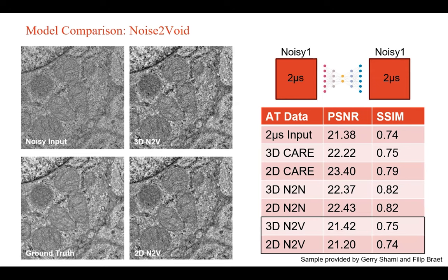Finally, I tried Noise2Void in both 3D and 2D, and unfortunately it didn't work. The output is still noisy for both the 3D and 2D models — not any better than the input — and the metrics back this up. When I showed this to Ben, it was a red flag that we should check the nature of the noise in these images, because as Ben mentioned, Noise2Void would not perform well on correlated noise.